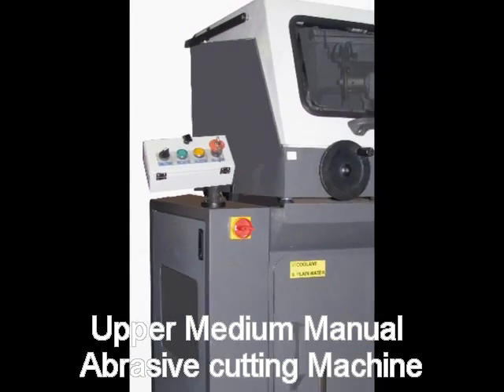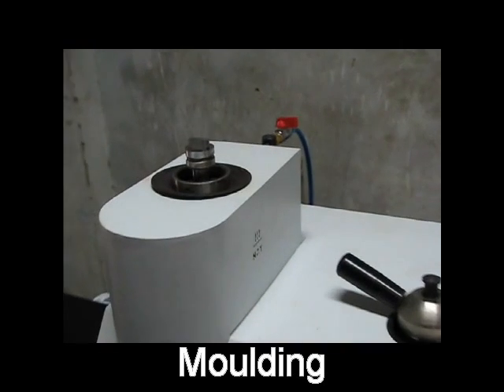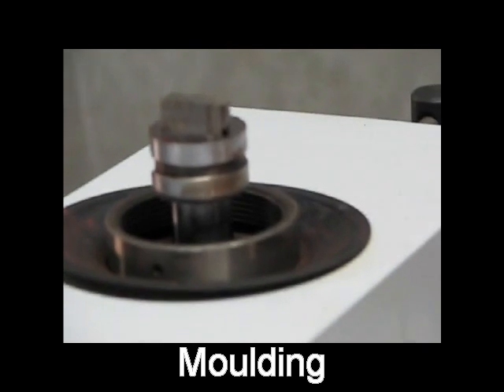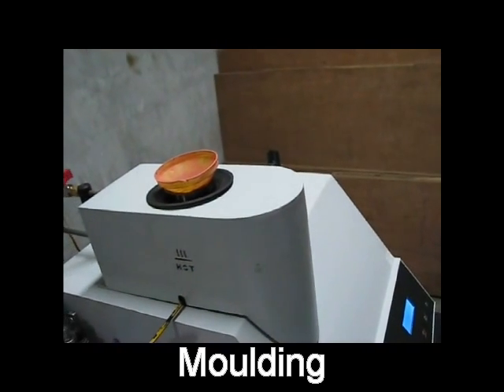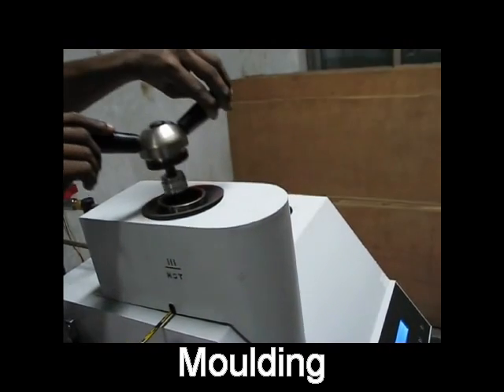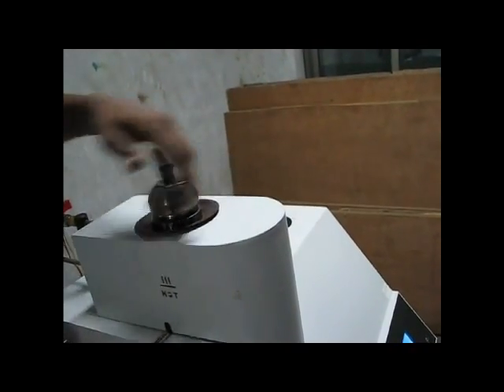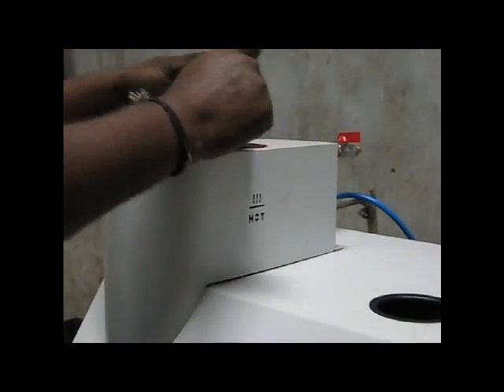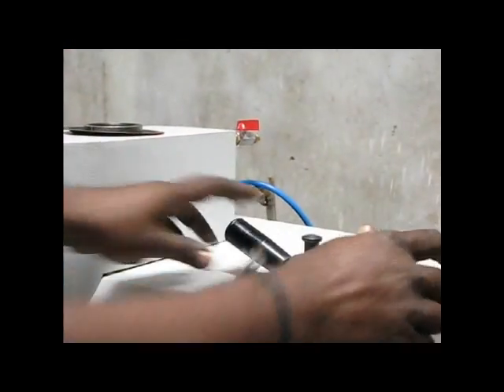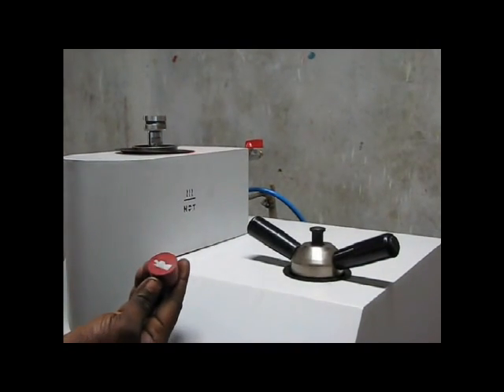This is an upper medium manual abrasive cutting machine. After sectioning, we will see molding the sample. We add bakelite powder to mold the sample. The sample has been molded — this is the sample after molding.